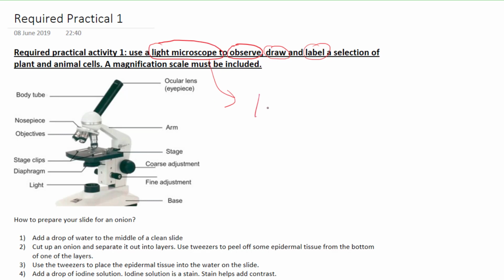So the way it works is that we have this eyepiece, right? The eyepiece is going to be the place where our eyes actually see the cell. From this bit we also have what we call the objective lens here. Okay, so there are two different lenses, and what they'll do is this will go to the cell up here, to the eyes up here. So it goes up to the eye up here, and then on the stage itself you will have the specimen. The light rays will shine right through.